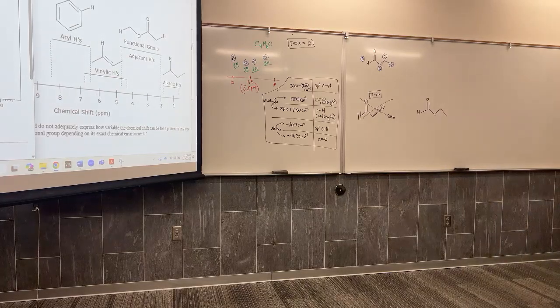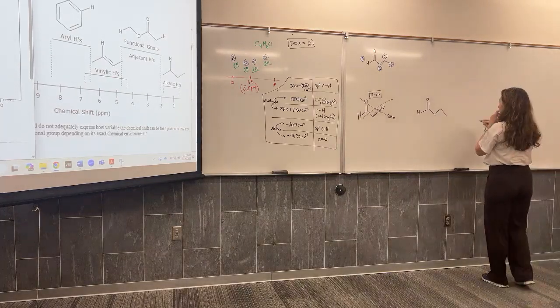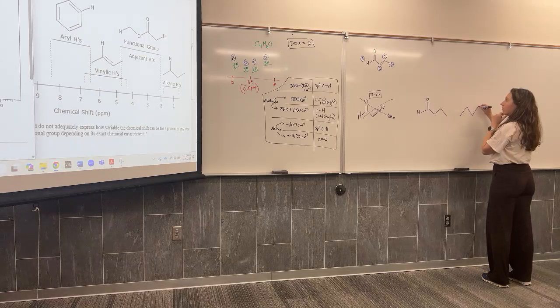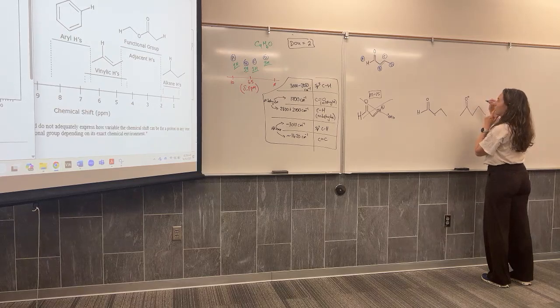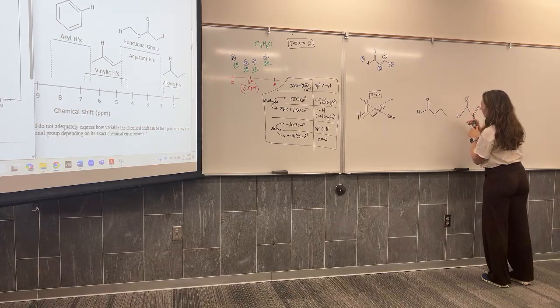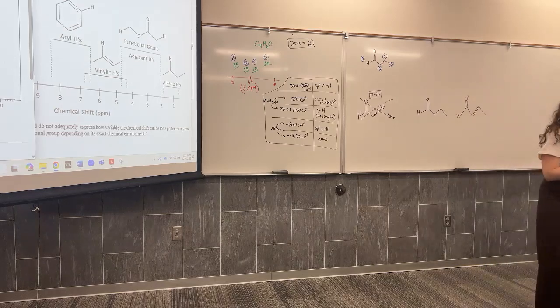So was the first one an example of alpha cleavage? Yeah, that would be an example of an alpha cleavage. Good catch.